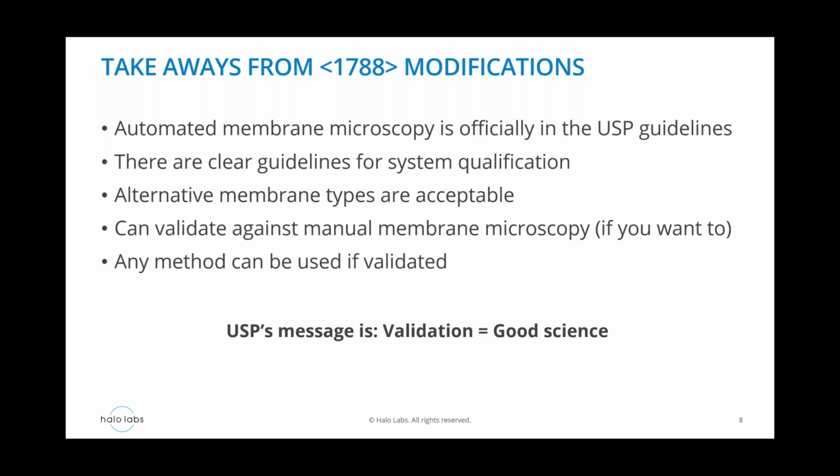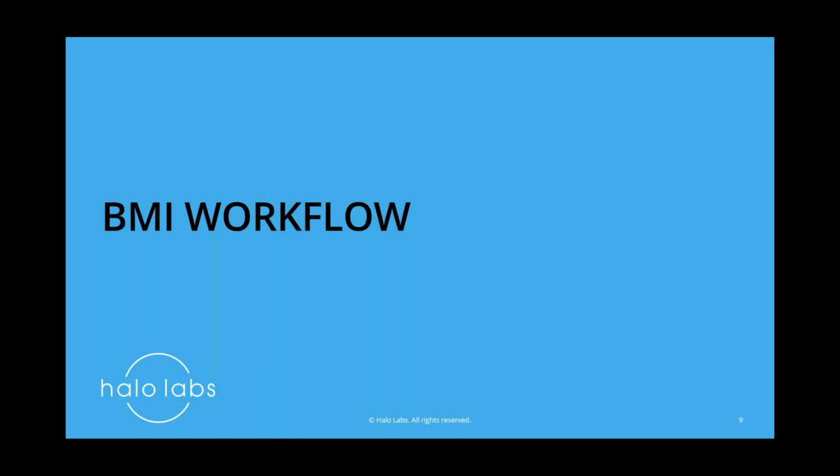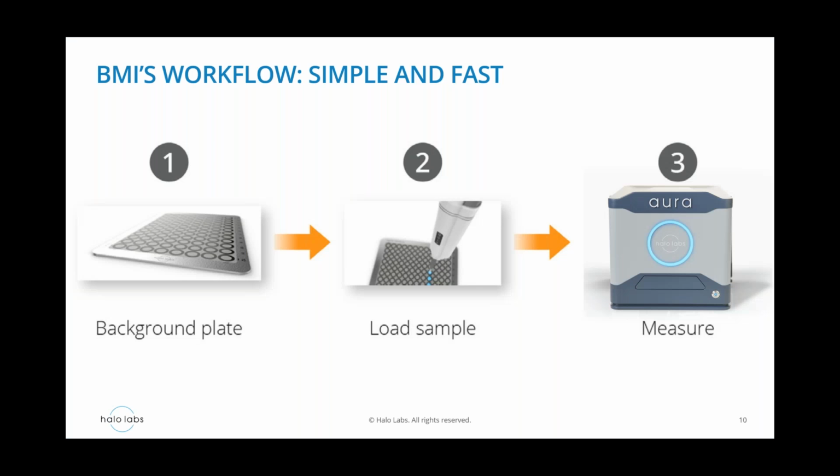And you guys are great scientists, so for validating the system, you just have to make sure that it's counting correctly, that it's sizing right, that linearity follows, etc. So a lot of it rests on you. These are just guidelines, but ultimately you're the ones who are going to say what is good enough and what is safe.